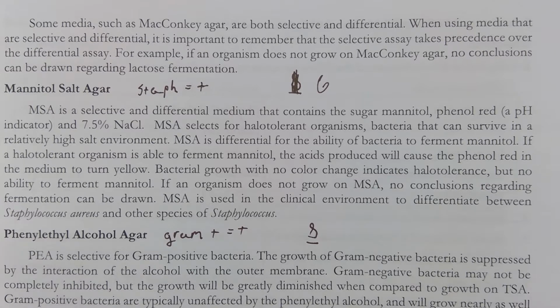If a halotolerant organism is able to ferment mannitol, the acids produced will cause the phenol red in the medium to turn yellow. Bacterial growth with no color change indicates halotolerance, but no ability to ferment mannitol. If an organism does not grow on MSA, no conclusions regarding fermentation can be drawn. MSA is used in the clinical environment to differentiate between Staphylococcus aureus and other species of Staphylococcus.